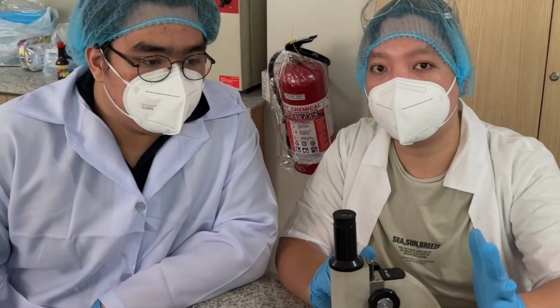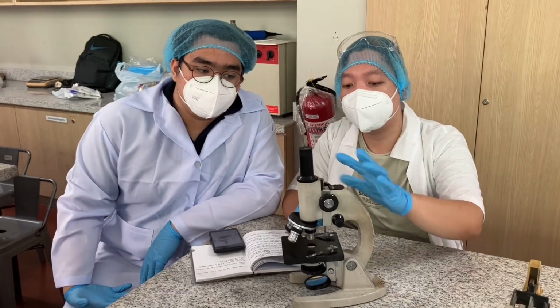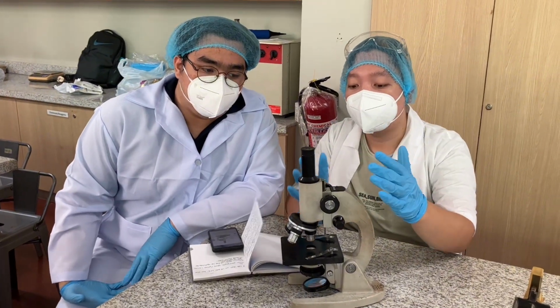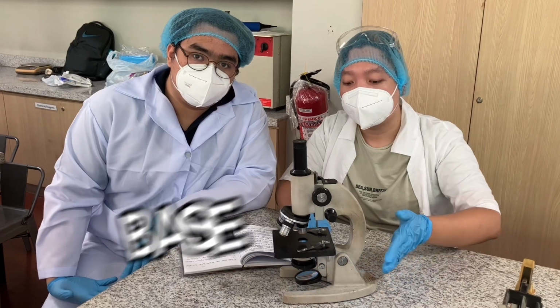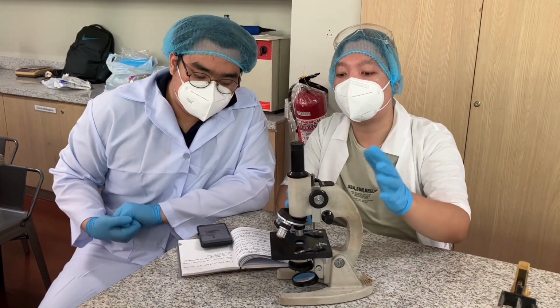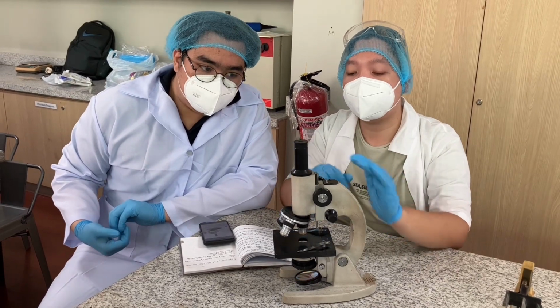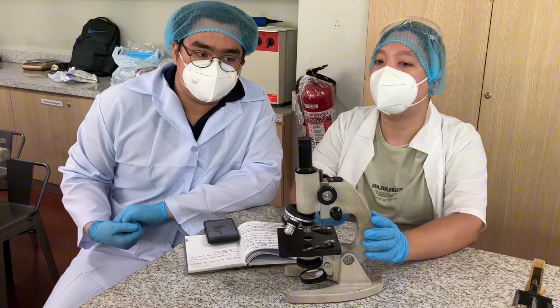Okay, so first thing we have here what we call the body. This holds most of the components. Now we have here as well our base. This is the base and its foundation para hindi siya bumigay, and of course to make sure na stabilize ang ating paglalagay ng mga specimens na yan. Now, you may go ahead, partner.